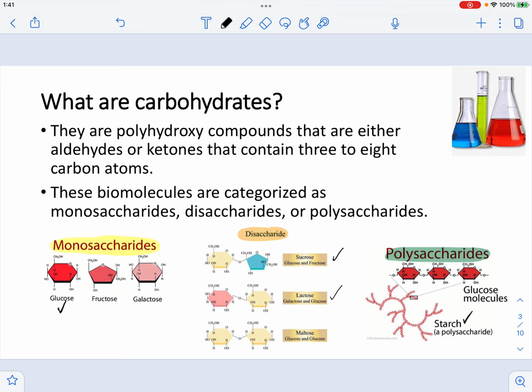Understand that starch, similar to sucrose, is linking many of these single glucose units together, and in this glycosidic bond that is unifying the glucose, we do not have an available anomeric position, and we are going to observe how that affects the results in the chemical test.